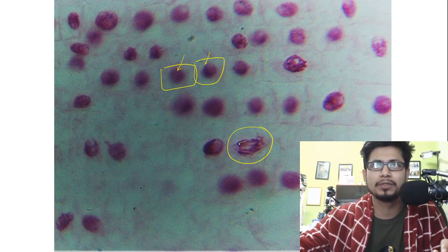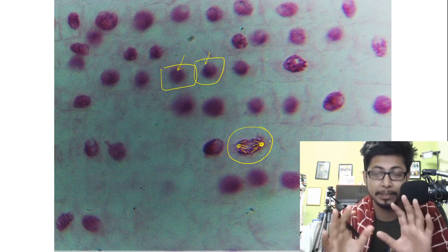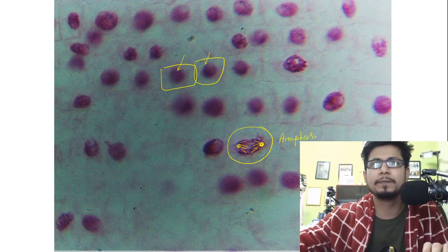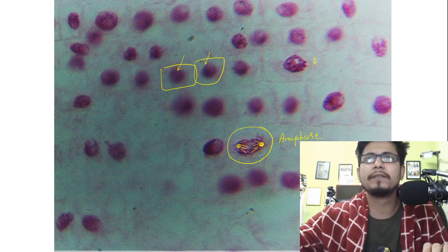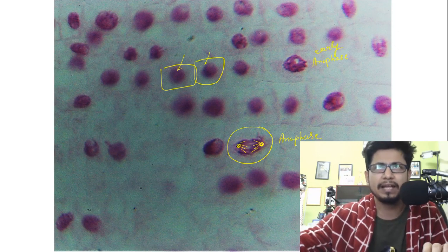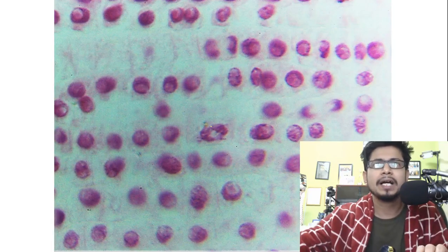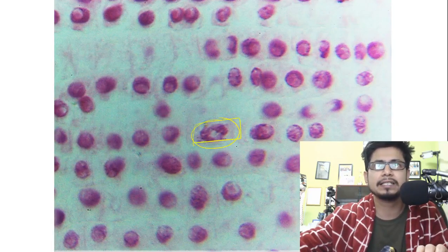But the most beautiful image is this one, where you can see the chromosomes being separated — MTOC1 and MTOC2 being separated. This is the real image, the image you see in the book. This is anaphase — pure anaphase. This is also anaphase, early anaphase. Here is another anaphase; you can clearly see the chromosomes connected and how they are connected.